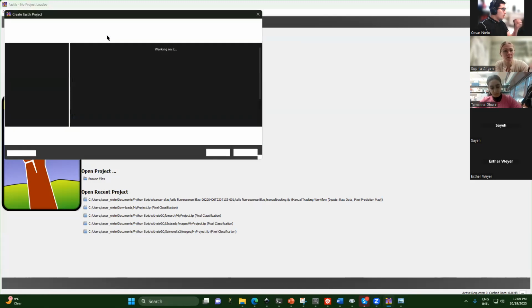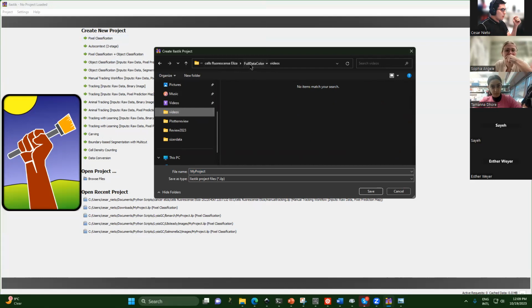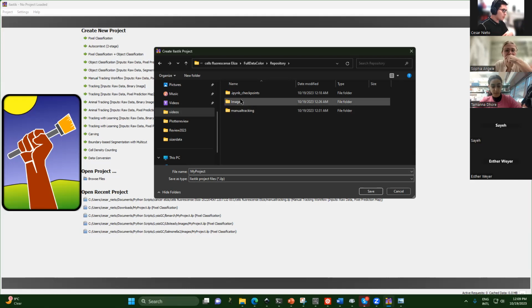Okay, so we start here with create new project. I'm going to save this in my folder. I have my images here in images.